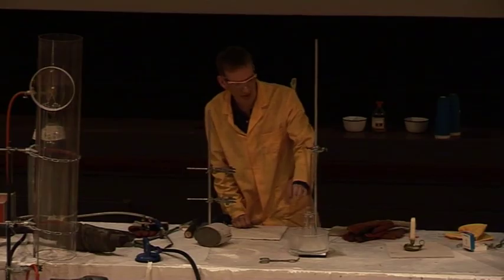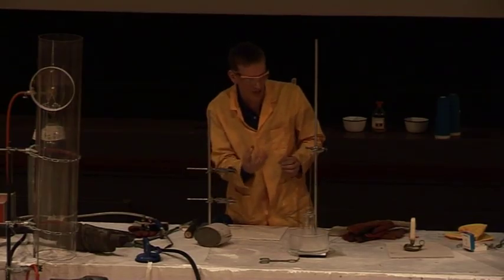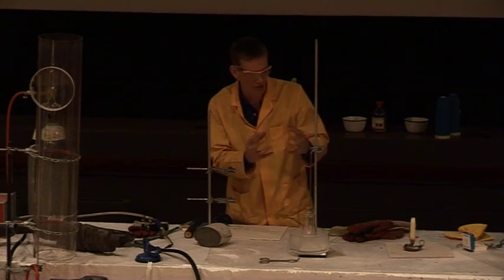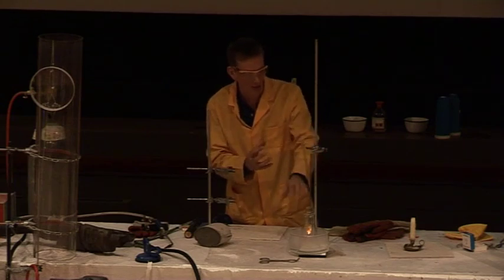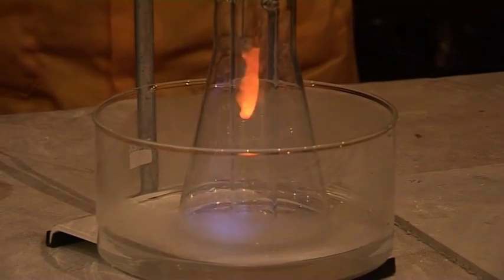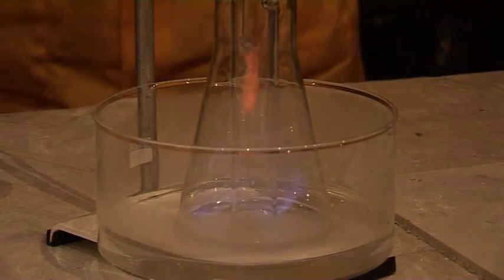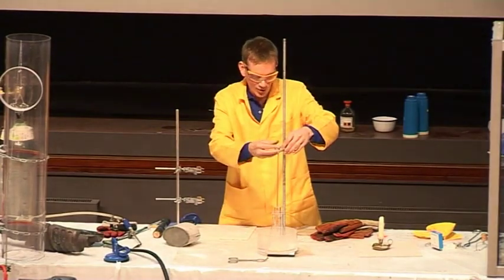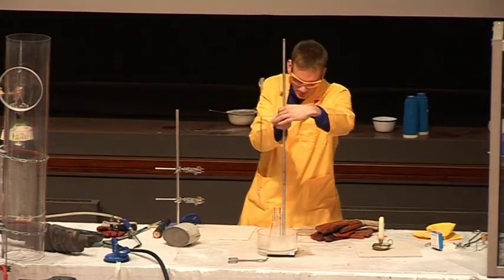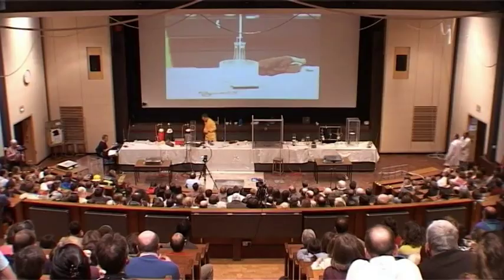So again, the methanol vapor is rising over the catalyst, and it will glow red hot as the methanol and the oxygen come into contact with each other on the surface of the catalyst, glowing red hot. That's it. And again, it should light the methanol itself. And then it blows itself out and it keeps repeating, which is really rather nice. Okay, well, we better stop this because we don't want any unwanted flames. So let's just remove the catalyst and Mark can deal with that.